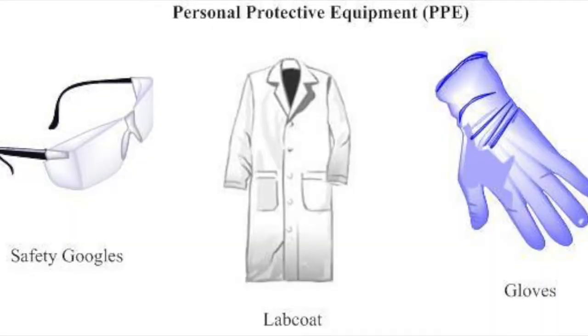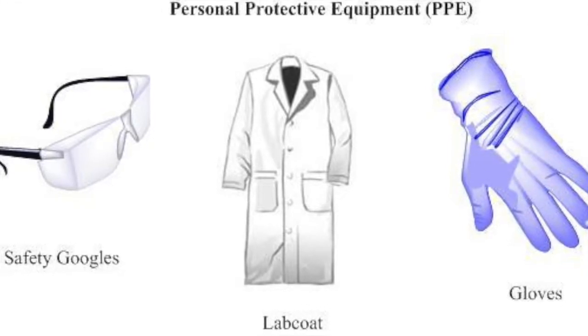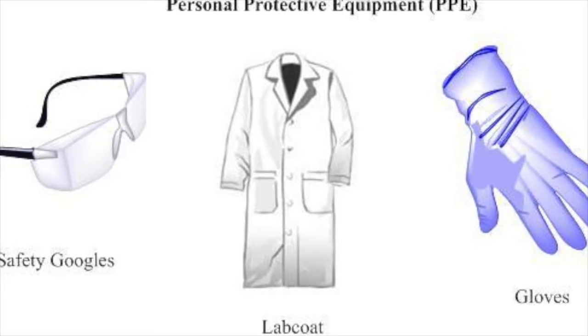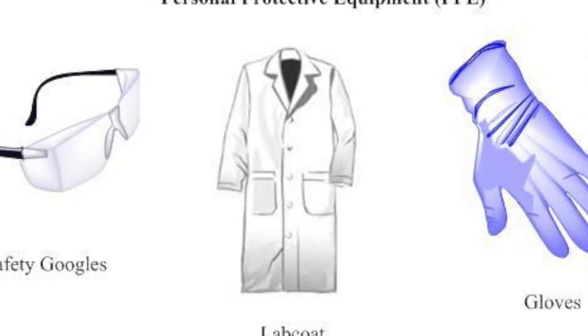As far as safety goes, you need to make sure that you are wearing the correct PPE. A knee-length lab safety coat and protective lab safety goggles are required. Make sure to be covering all parts of your skin. A lab coat, long pants, and sneakers will prevent the sodium hydroxide and malachite green from contacting skin, while the goggles prevent the chemicals from contacting eyes.